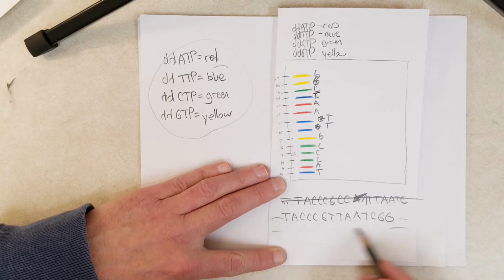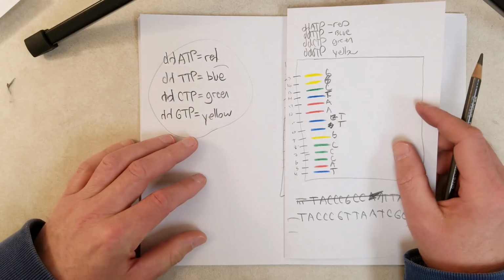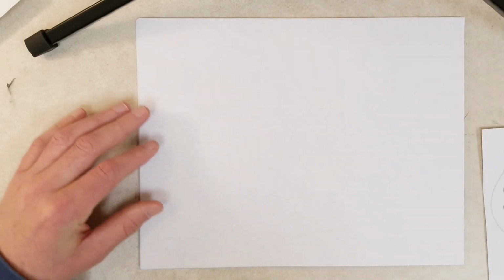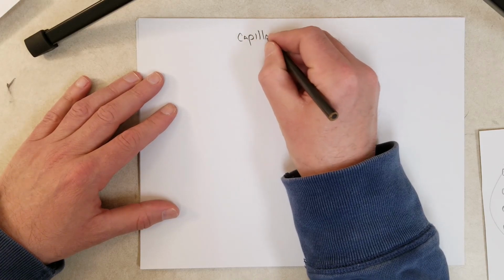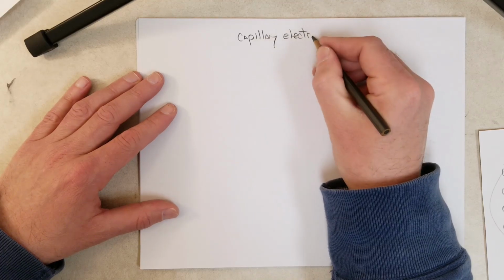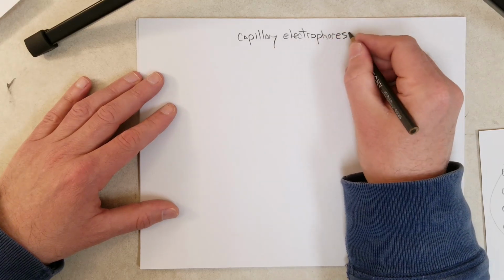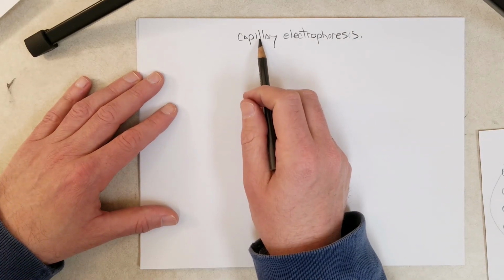We could do the template strand by complementary base pairing rules. Okay, great. Okay, so one more advance. We don't have to run these gels anymore. There's an automated system. You know, we still need humans to set it up, right? To put the samples in, or at least put it in a place where a robot can get to the sample. But it's called capillary electrophoresis. And it's a lot like gel electrophoresis, but the gel material is inside a little capillary tube.